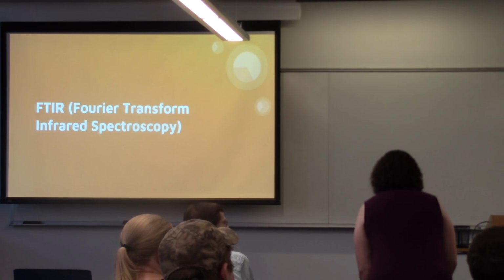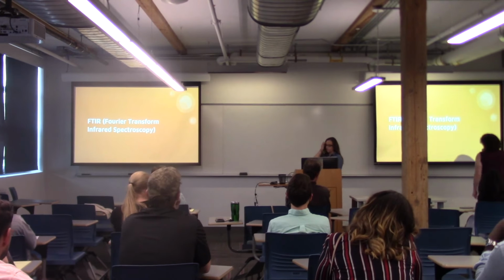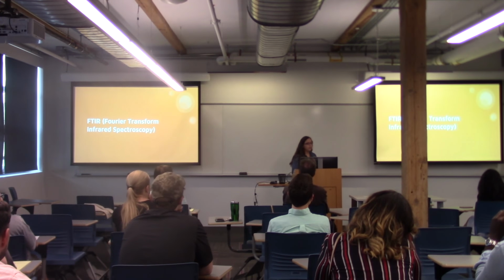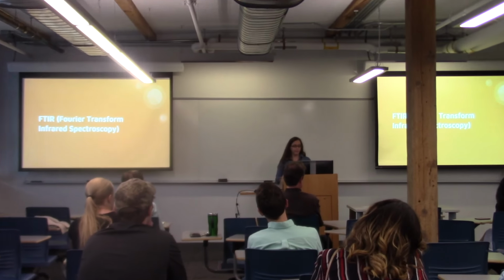And now we'll turn to Erin for the FTIR. Hi, so I did the FTIR, which is Fourier transform infrared spectroscopy.